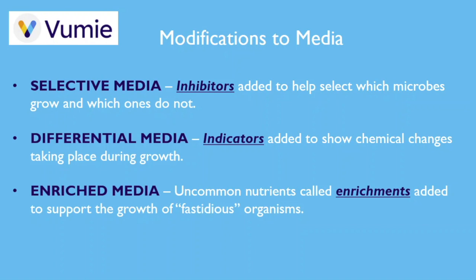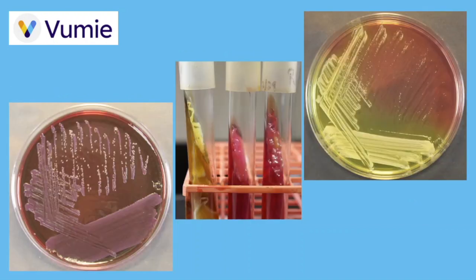So it is safe to say that a fundamental part of our study of bacteria in this course will center around the variety of growth media used for their growth and study. We will look at the types of media mentioned here in greater detail as we move through the semester.